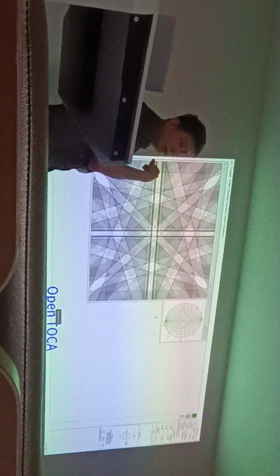So what we do next is we go to TOCA software and set up. Just now the Prof mentioned the different crystal structures, the graphites, so we need to know exactly what material. If you're working on HCP, don't put FCC. You won't be able to see it. It's wrong. So this is an FCC sample, face-centered cubic. Then we enter the Euler angle. Now the orientation comes.